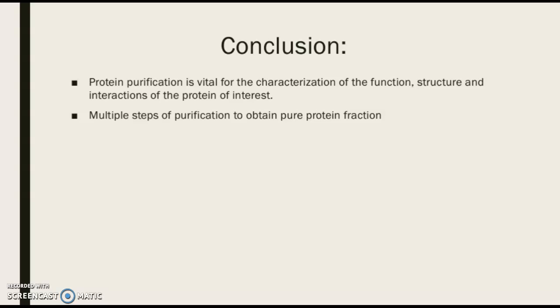After following our purification steps, we undergo a lot of forward directions. As I mentioned, we use small drugs to inhibit this protein, but before we can do that, we need to crystallize the protein and look for the pockets where the molecules will bind. But for now, this PowerPoint was just to demonstrate what we learned in the classroom of how to use chromatography methods as well as dialysis and SDS pages in real-life applications. This is just to characterize the functional, structural, and interactions of the protein of interest.